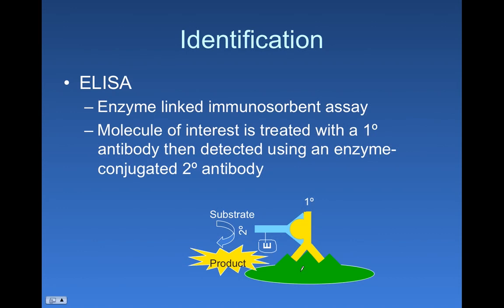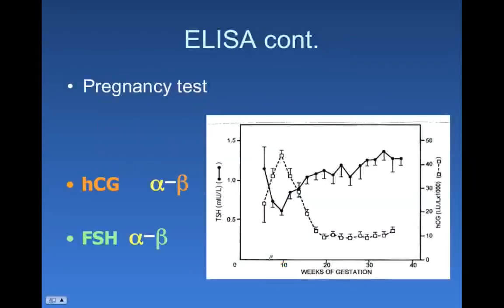Okay. So those are ELISA tests, right? And they rely on antibodies, and antibodies have great specificity, so you can engineer antibodies to detect almost anything you're interested in. And using this ELISA technique, you can detect the formation of this complex and the presence and quantity of how much of your protein of interest is present. Pregnancy tests use a variation of the ELISA.